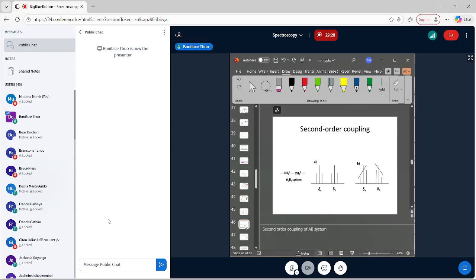And that's what we are illustrating here, that as the chemical shifts between the coupled hydrogens decrease, the second order coupling occurs or is more clear. The outer splits shorten or decrease as the middle ones increase. This happens until the two chemical environments are the same, where the coupling collapses.